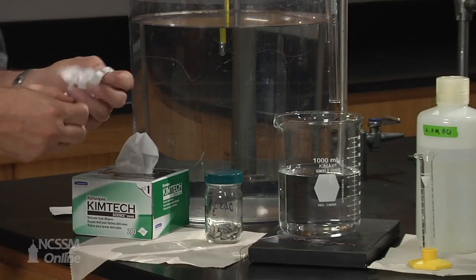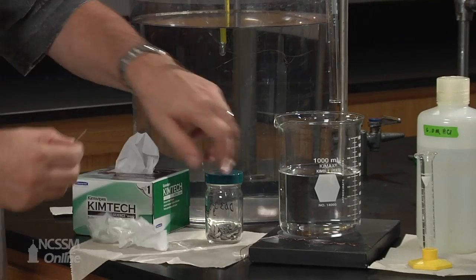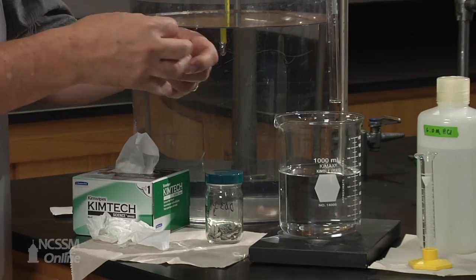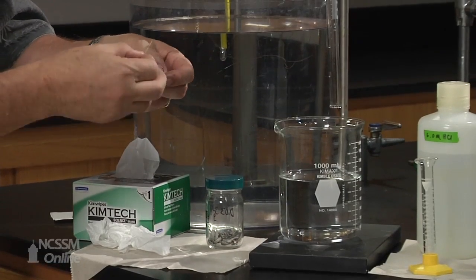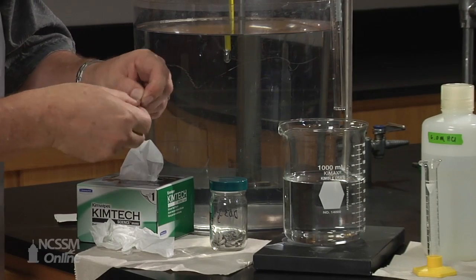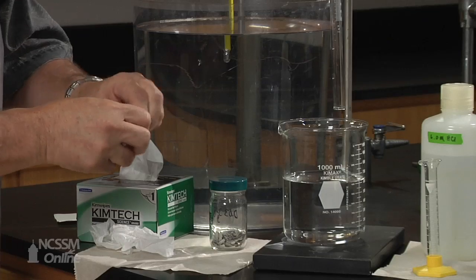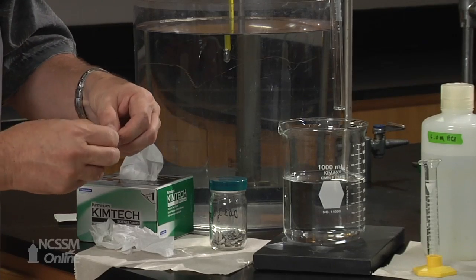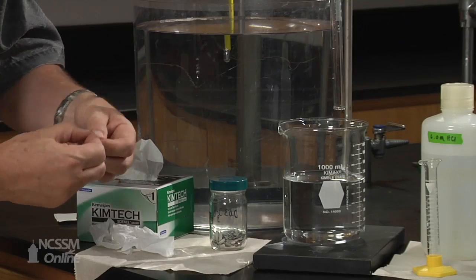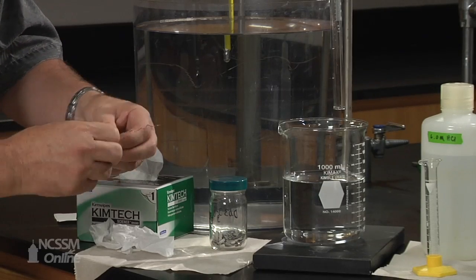So now that we have massed the magnesium, we can handle it with our fingers. And we're going to essentially place the magnesium strip in a cage of copper wire. So that during the reaction, the magnesium strip stays in its place and it doesn't float up and get caught on the side of the gas measuring tube.